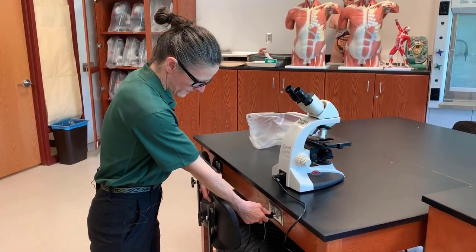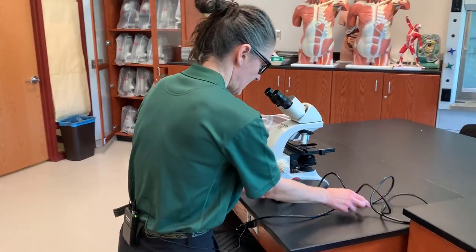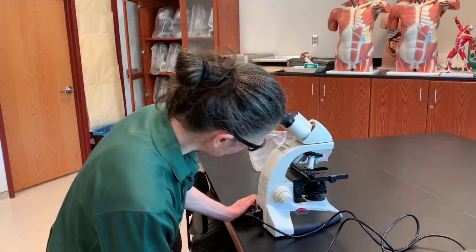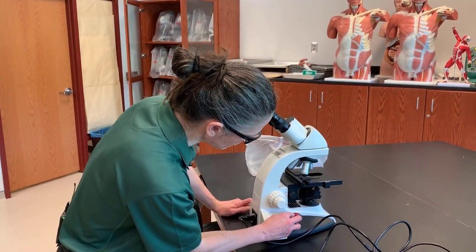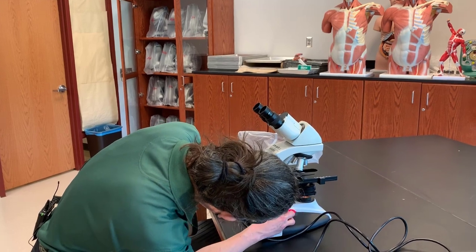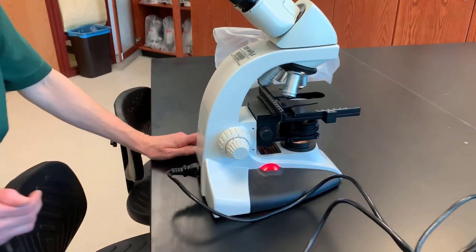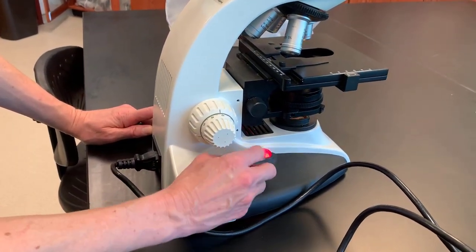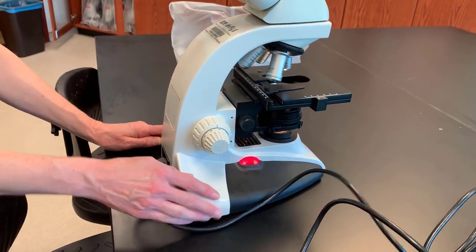Then we will plug our microscope in, being careful not to have the cord dangling so that you could trip over it. Most microscopes have an on-off switch and a light intensity control. We have a substage light here which allows for the light to be brighter or less bright. In this particular microscope, the control for our substage light is also your on-off switch. In other microscopes, you'll have a separate switch.